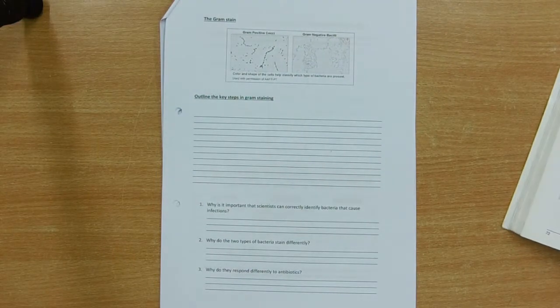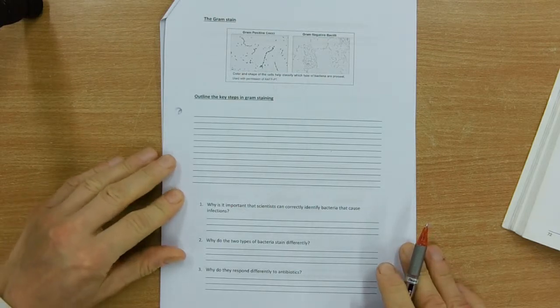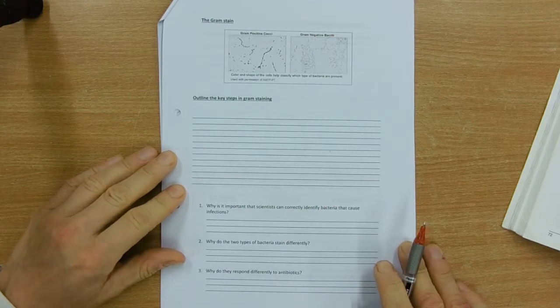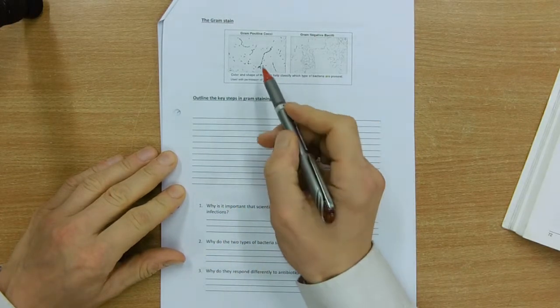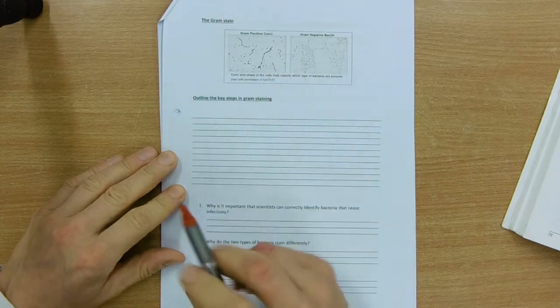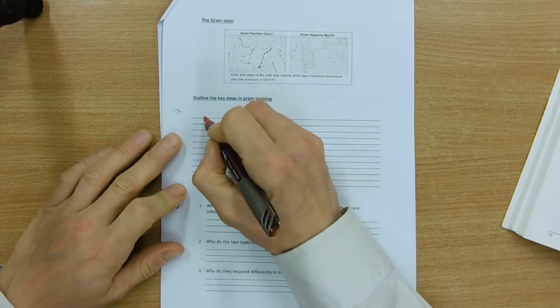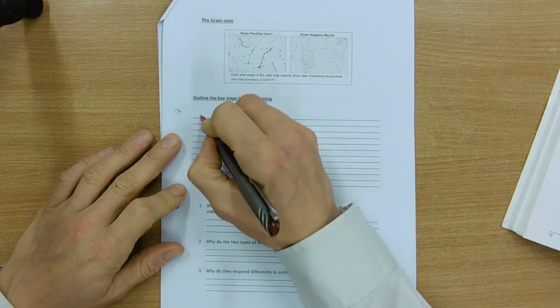So, the gram stain. So the gram-positive bacteria and gram-negative bacteria. Key steps. Well, there's lots of steps, but the ones that are most important, they need to get the bacteria fixed onto the slide. They do that just by heating it, and they kind of weld themselves on. But let's put this back to basics.